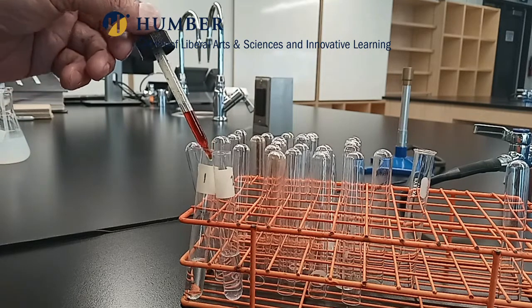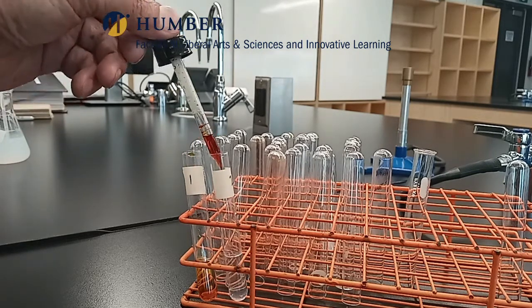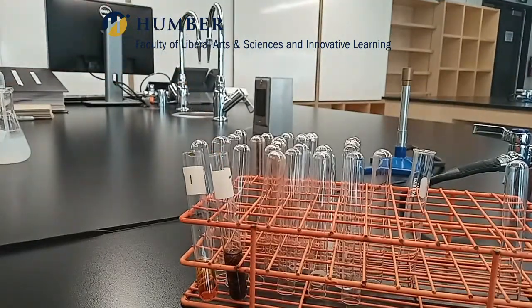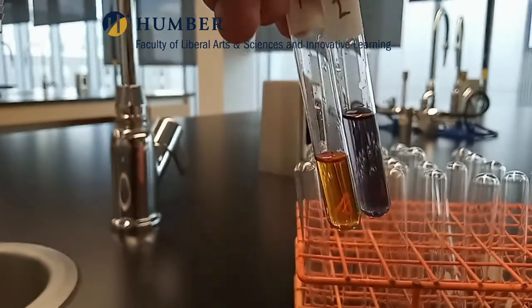Add 4 drops of Lugol's solution to both the test tubes. Record your observations.